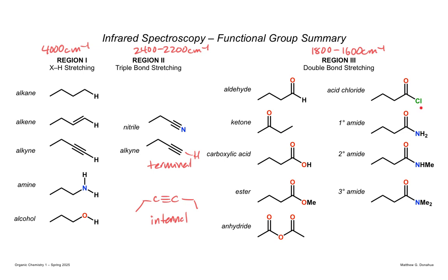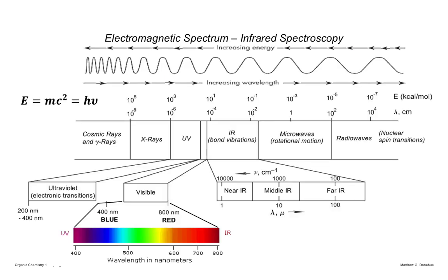So for example, in the mass spec, we learned about chlorine isotopes. That can give you a hint if it's chlorine. We learned about the odd mass rule. If the mass is odd, there's an odd number of nitrogens, so you might have an amide. So you have to start making these connections to build confidence into what you're going to claim as a structure. Any questions?